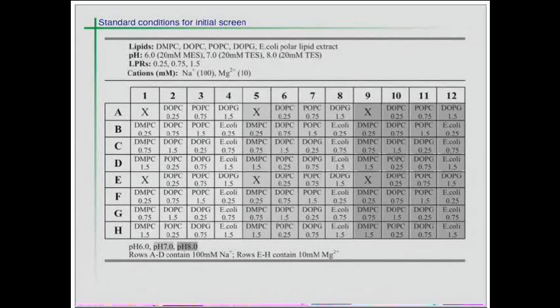The combination of all these parameters already gives you 96 conditions. Now, you will have to set up 96 dialysis buttons and prepare 96 specimens and image them manually. Even a very motivated and talented postdoc will run out of hope very fast. So you really need to automate all this.